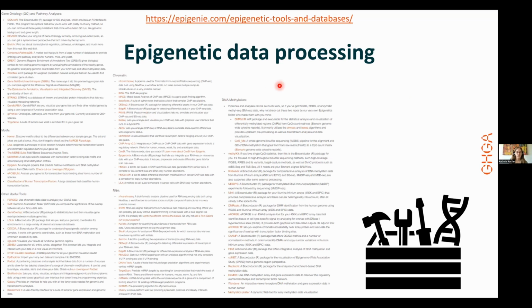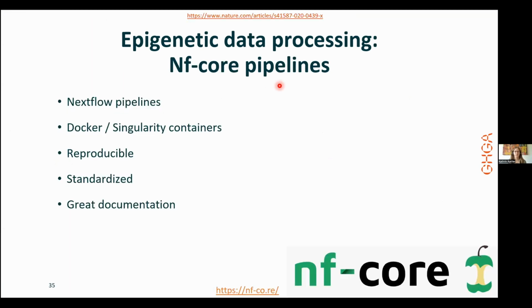So what I wanted to say instead is that if you want to do epigenetic data processing, a very good start are the nf-core pipelines. You might already be familiar with them.